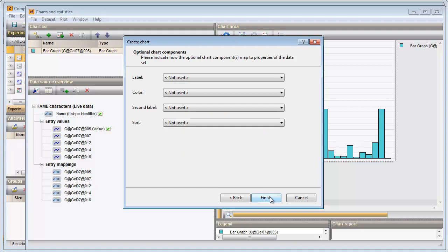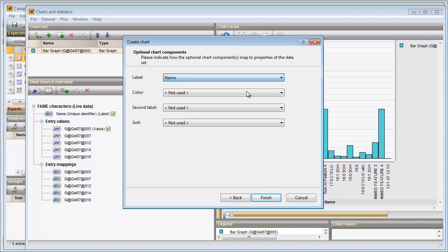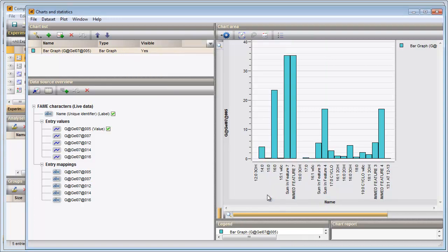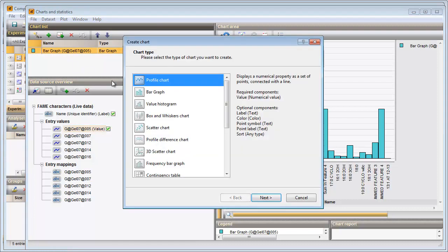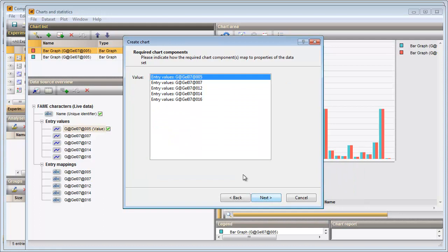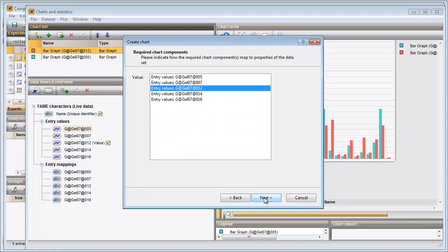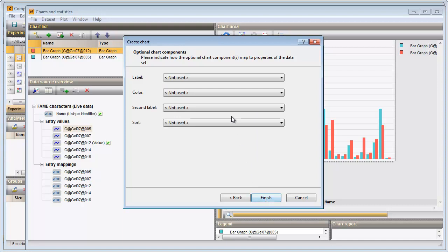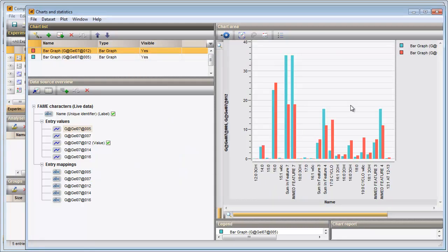In the last step I can specify some additional settings. I select 'Name' to plot the names of the fatty acids on the x-axis. The bar graph is updated and each bar has a length proportional to its value. I will now add a second bar graph. I enter the Chart wizard again, select Bar Graph, and select another entry from the list. The graph is updated in the Charts area panel.